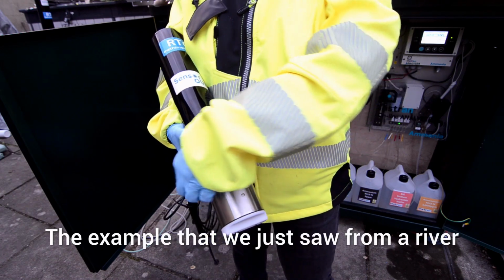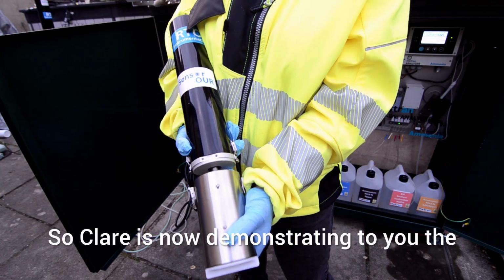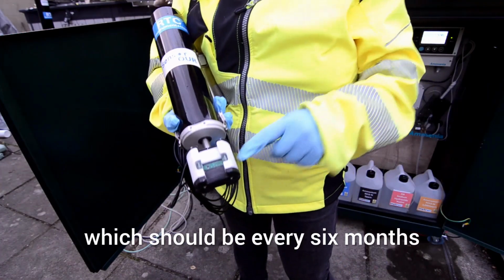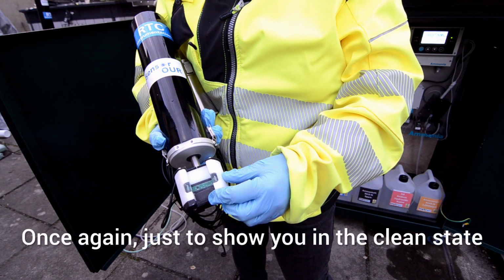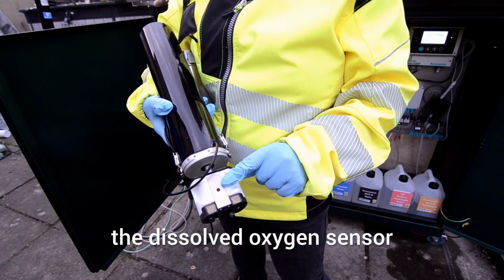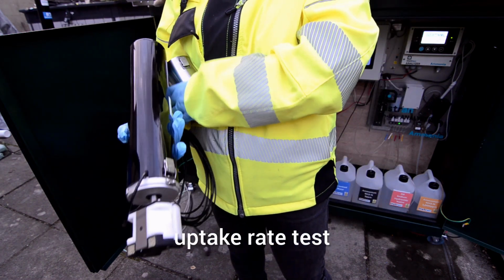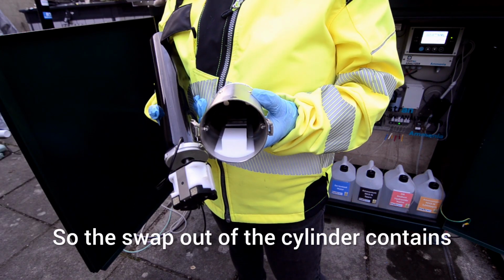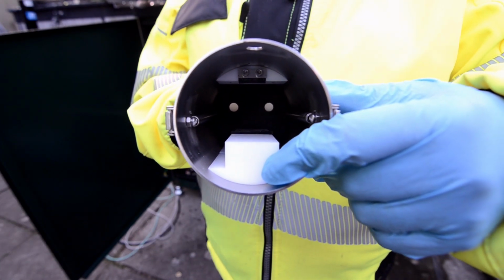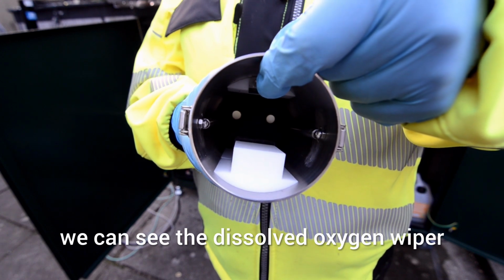The example that we just saw from a river water system is actually quite representative of what will happen in an activated sludge plant. So Claire is now demonstrating to you the swap out of the wear and consumable parts on the system, which should be every 6 months. Once again, just to show you in the clean state, the MLSS sensor, the dissolved oxygen sensor, and actually the two devices on the bottom are aeration stones to do our oxygen uptake rate test. So the swap out of the cylinder contains the MLSS calibration blocks and wipers here, and on the other side, the upper side, we can see the dissolved oxygen wiper.